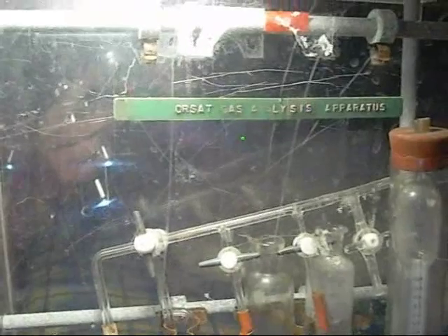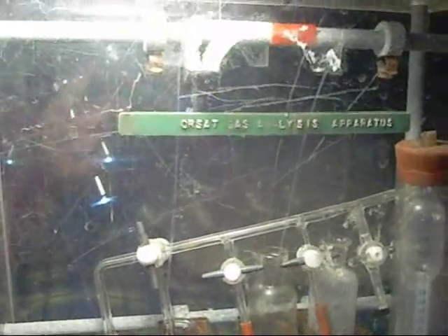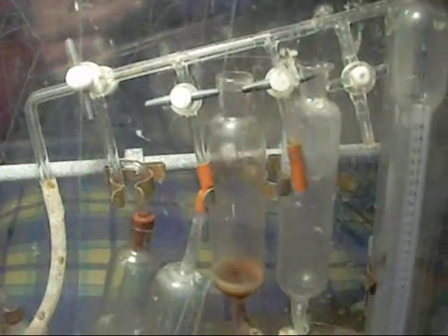Hello viewers, Mezcal here. I scored this thing for $10 — it's an Orsat Gas Analysis Apparatus. Interesting looking setup; I'm not familiar with it at all.